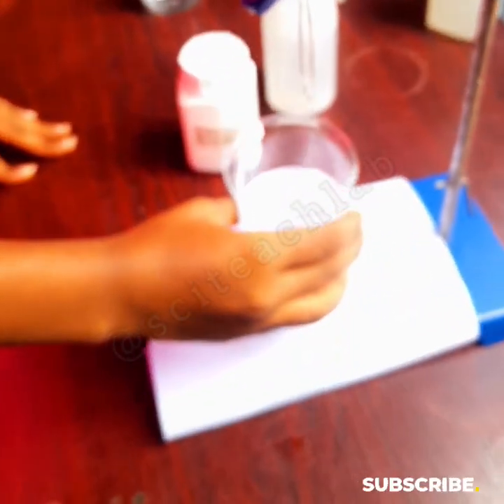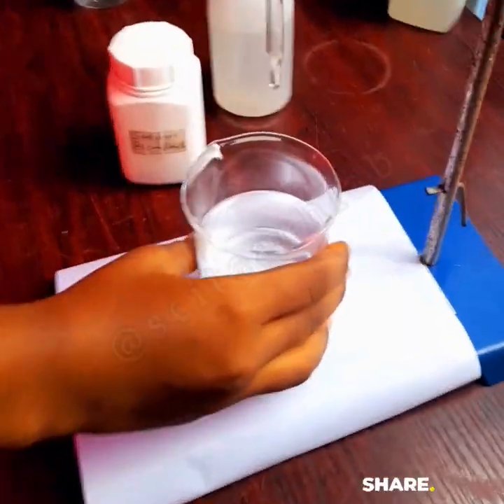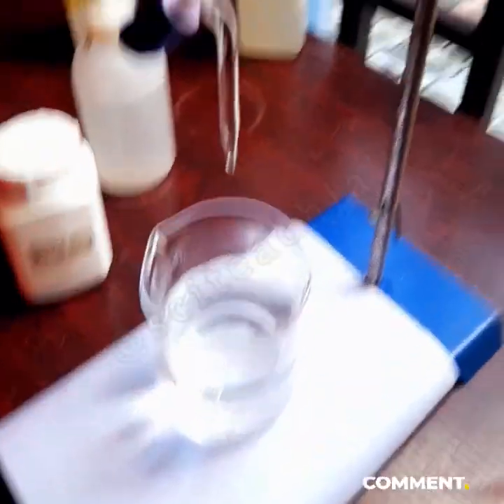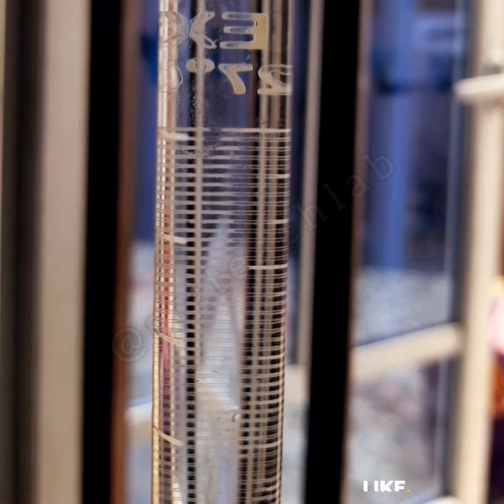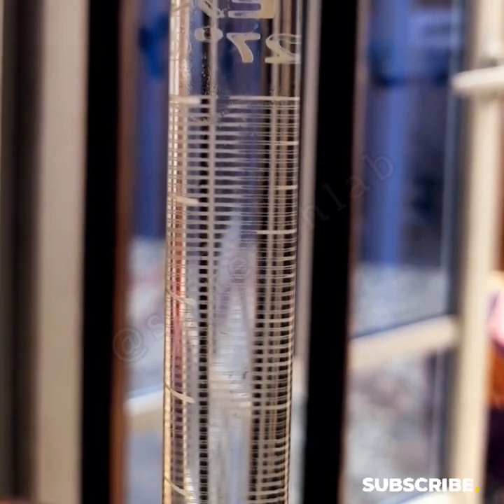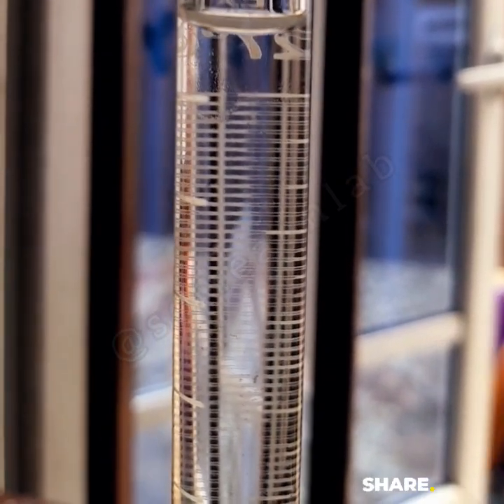Alright, so if it passes the 0 mark, no problem, you can drop back the beaker and reduce the content into it. Make sure that the meniscus sits on the 0 line. Do it very carefully to make sure that it doesn't pass the line.